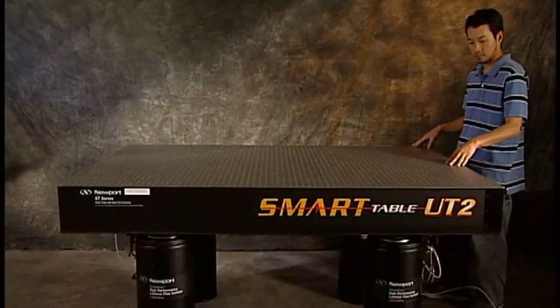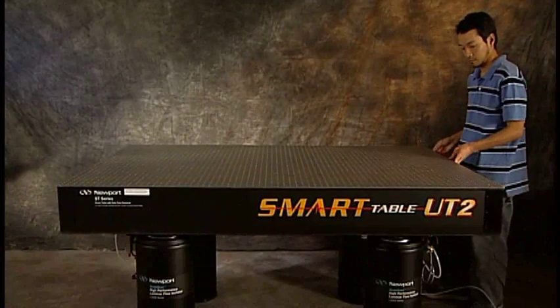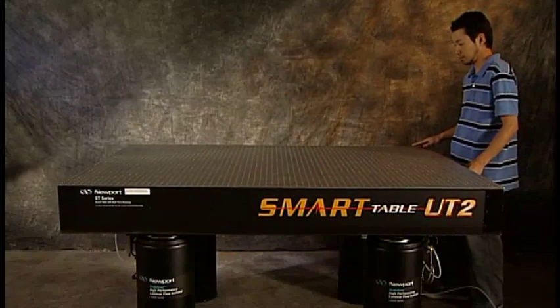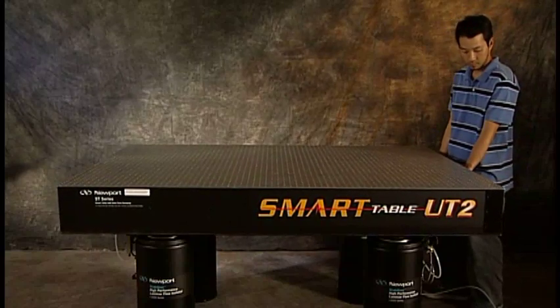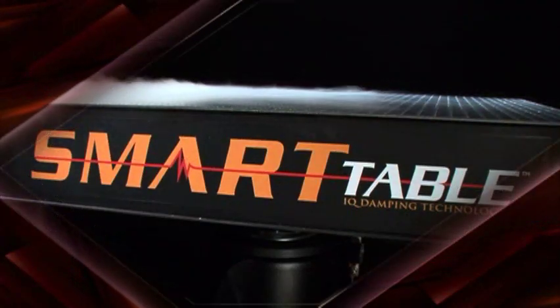Final Test: Slightly push down on the tabletop — it should move down easily. Slightly lift up on the tabletop — it should move up easily. Push sideways on the side of the table — it should easily move from side to side. Congratulations! You have successfully installed your new vibration isolation system.